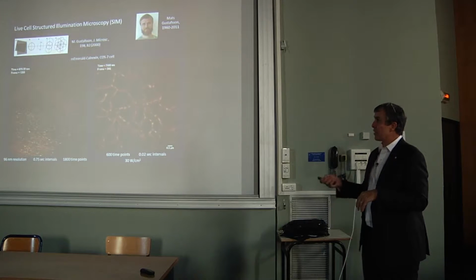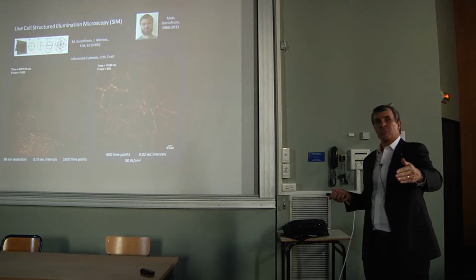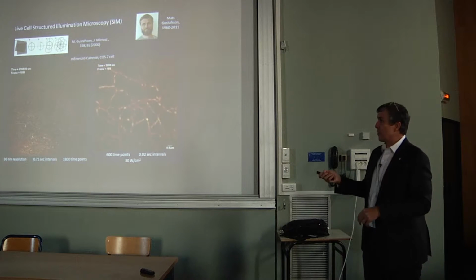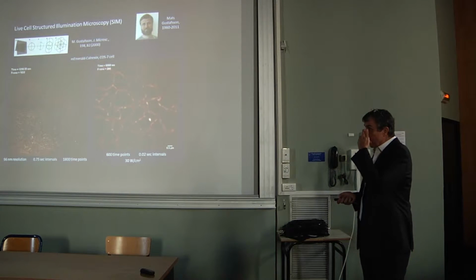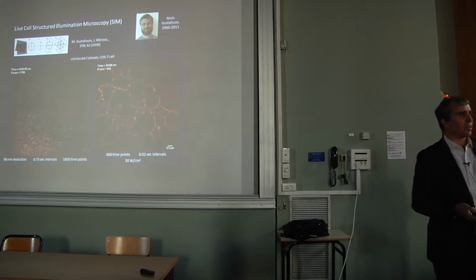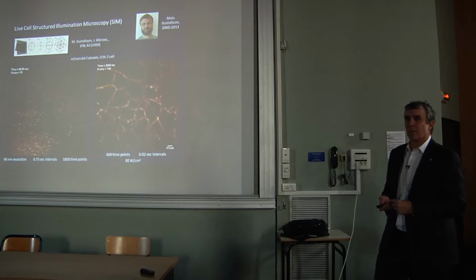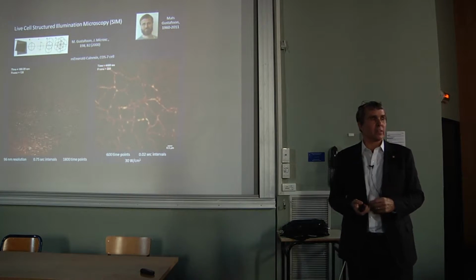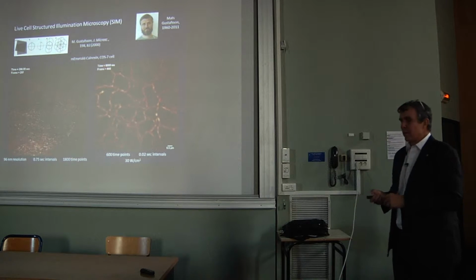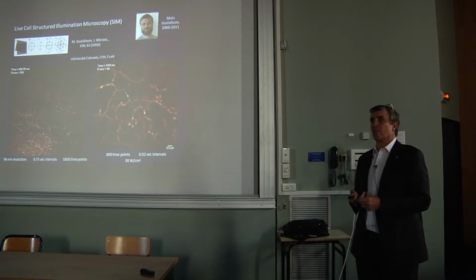By doing that, and that sort of demodulation approach, you're able to extend the resolution by a factor of 2 because you can't write a finer grating than the diffraction limit itself. So that's one of the reasons the committee cited in not having SIM be part of that Nobel. But I actually think that's a mistake because I think SIM will actually be the super resolution method that will end up contributing the most to biology. And that's because this limitation of a factor of 2 is in some ways a strength.